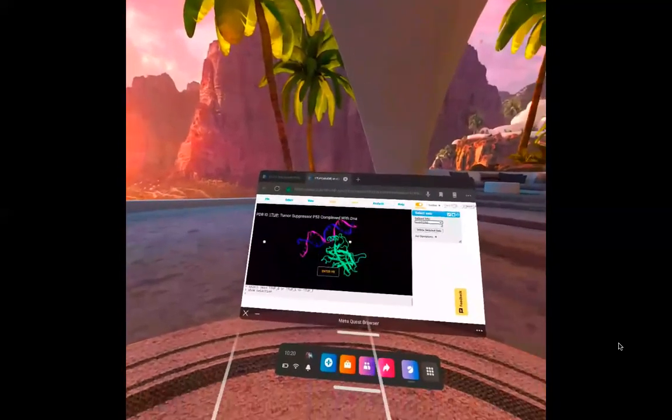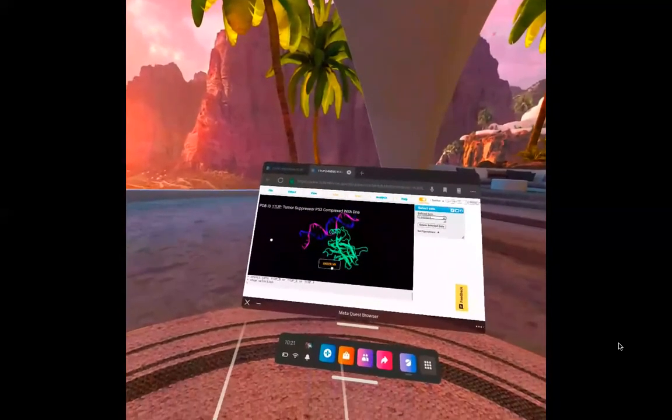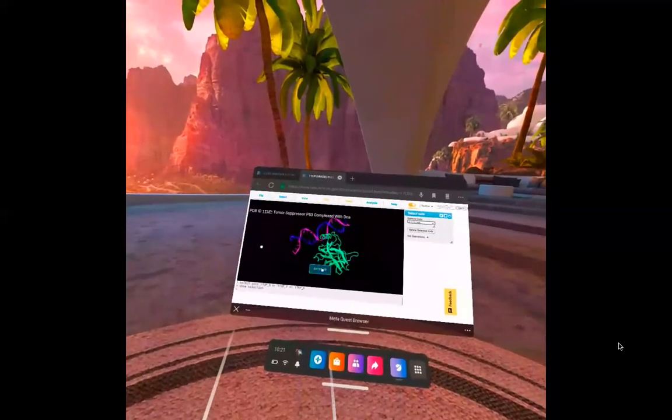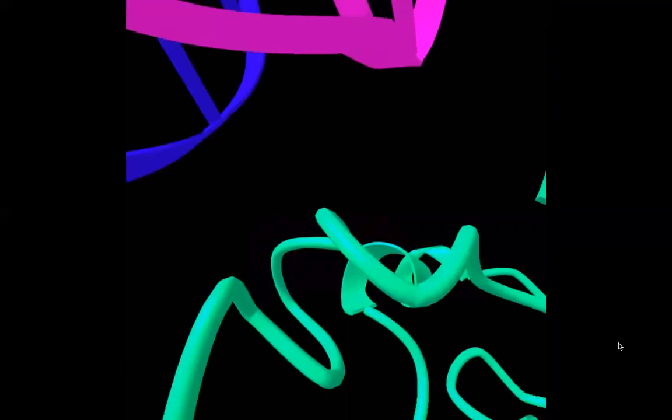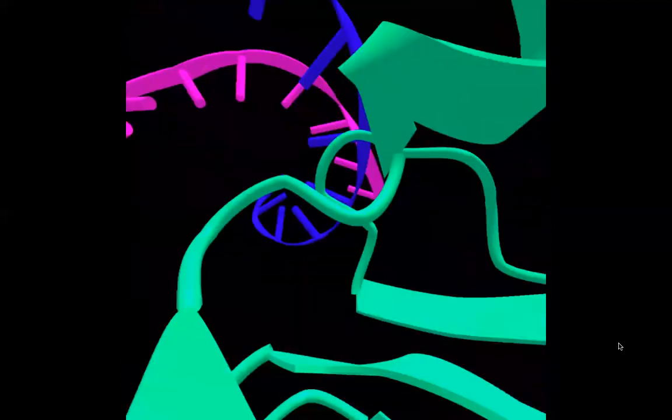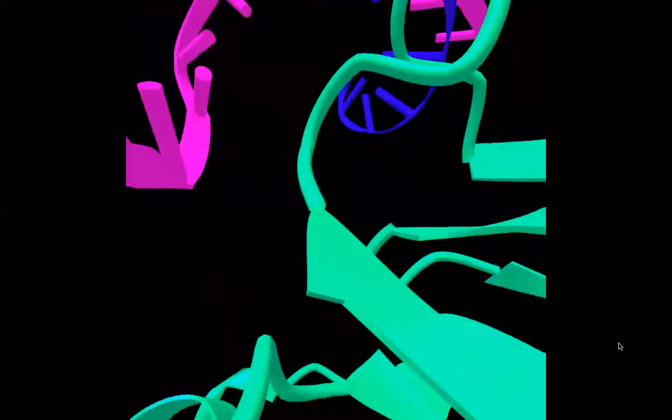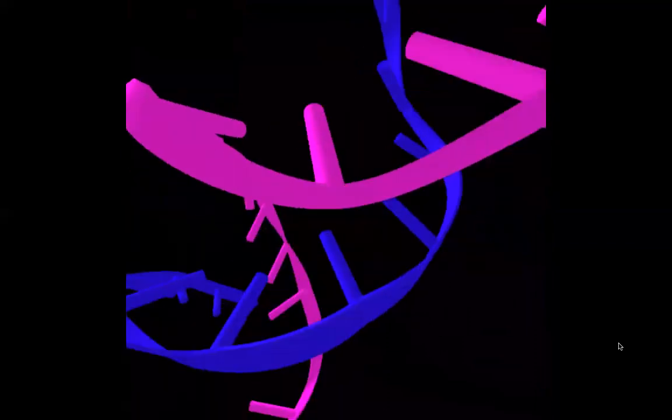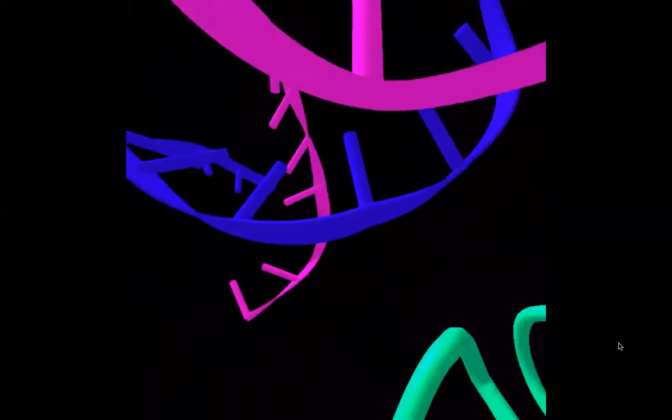So it's a simplified view, and you go to enter again. Now you only see the chain B and two nucleotides chains.